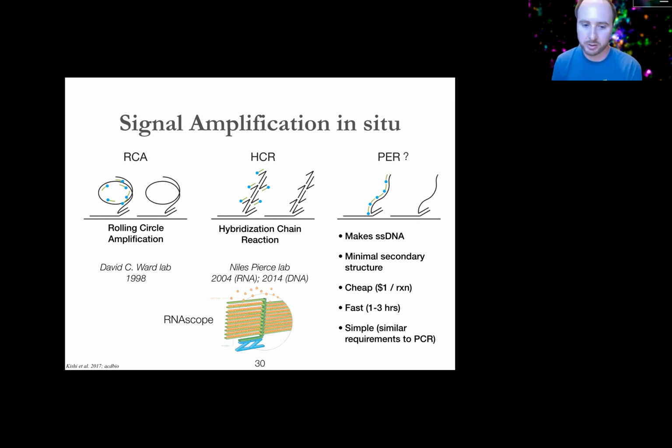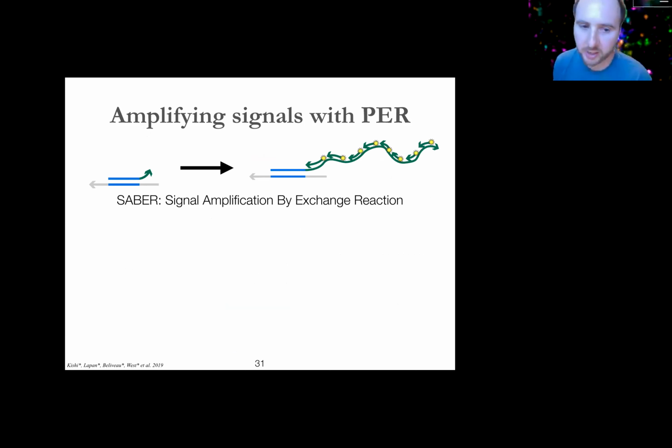the HCR approaches. And so conceptually, what we're thinking about essentially is making something quite similar to the RNAscope product you can buy, but a little bit more on the order of providing a toolkit for researchers to do something in their own hands cheaply, as opposed to making a product that someone would have to buy pre-synthesized at a reasonably high price. And that is the genesis of SABER, or signal amplification by exchange reaction, or by PER, which is a term that Josie coined that I think is quite clever.